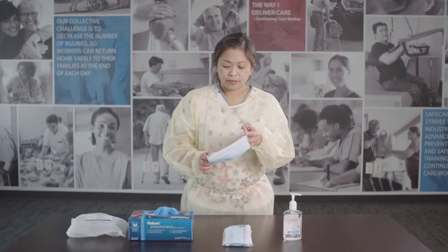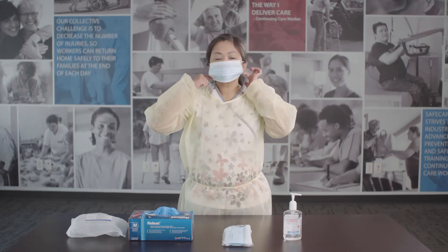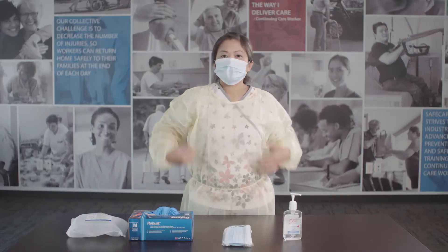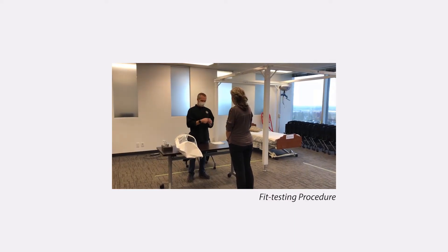Put on a procedure mask. Holding the mask to the front of your face, hook the loops around your ears. Pull the bottom of the mask down to completely cover your chin. Press on the nose band to form it to your nose.